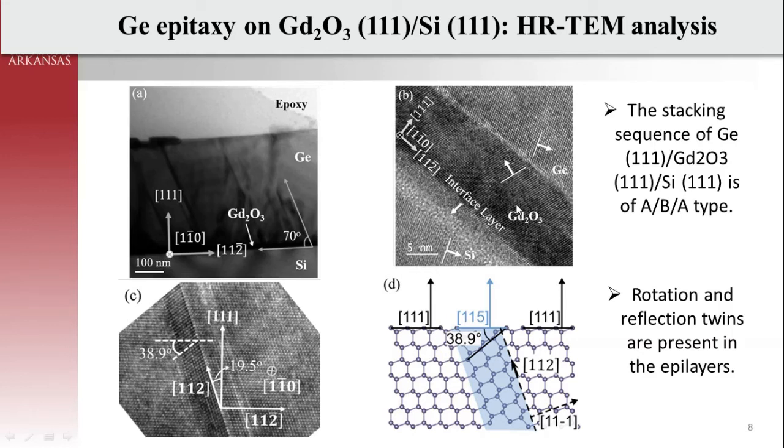In fact, I did the TEM analysis first, and I should have put this slide first and tried to explain the consistency by using RHEED and mainly by using pole figure analysis.